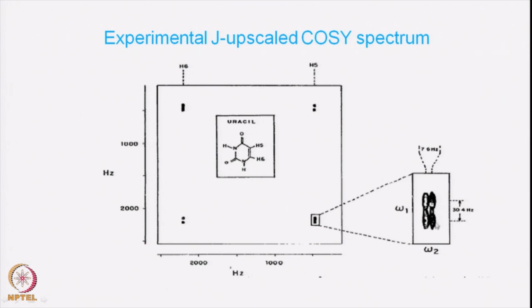So, this is a clear indication of the enhancement of the resolution, and you can see the positive and negative components here very clearly. Although the same color is used here, all the 4 components can be seen very clearly in this spectrum. Therefore, this helps you to improve the resolution in the spectra and enable measurement of the coupling constants wherever they are not sufficiently well resolved in your spectra.